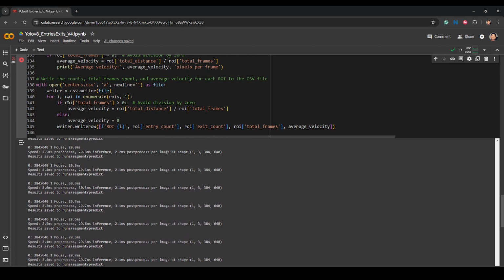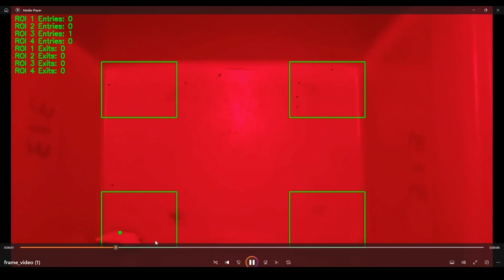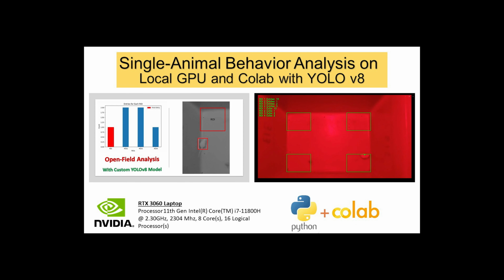I'm just doing a few seconds of this video. And you get pretty much the same output as the script on the local GPU.